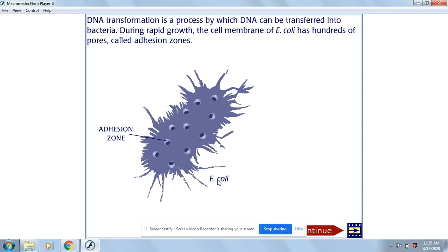Good morning. Today we are taking a very important topic in the area of RDN technology, which is called recombinant DNA technology. It basically deals with the fusion of two different DNA molecules. If we join two different DNA molecules with the help of specific enzymes called T4 DNA ligase, it creates recombinant DNA, that is, a recombinant DNA molecule.